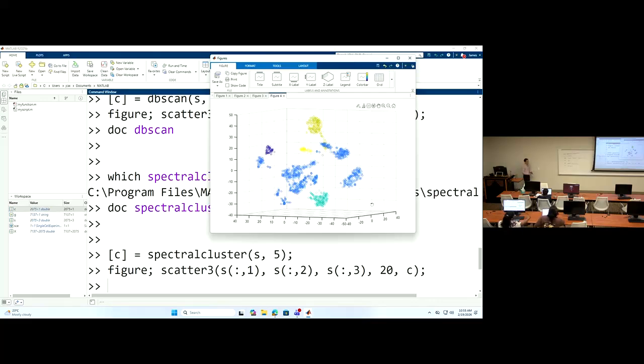So for us, the advantage of spectral clustering is not so obvious in our case, because we just want to directly use k-means to group these obvious clusters. We know there's some kind of cluster here, but it looks like spectral clustering did not perform as well as direct k-means in our case. So what is our case?